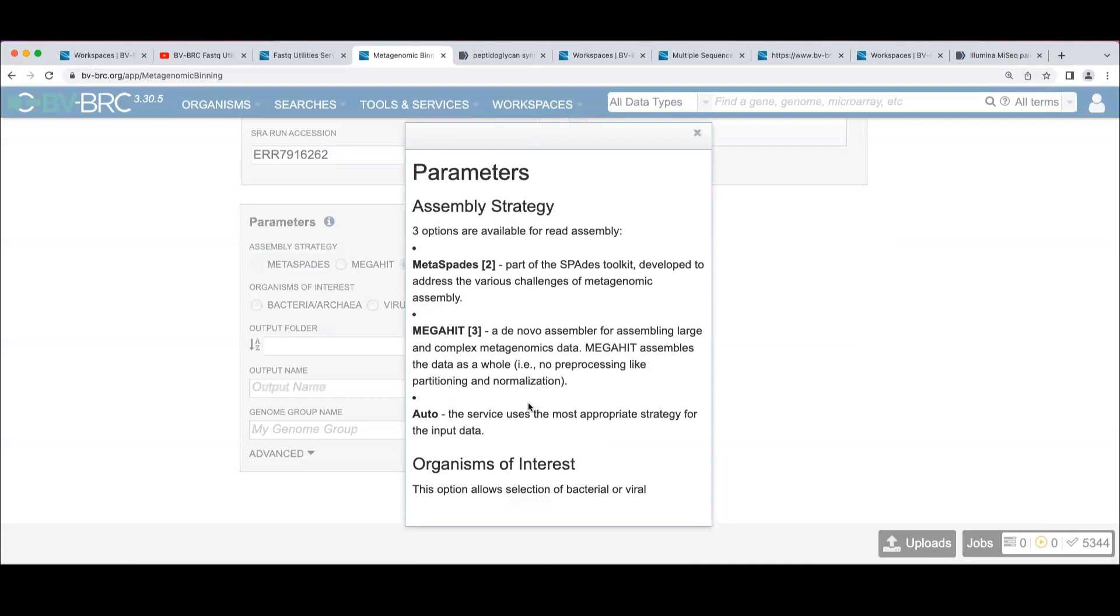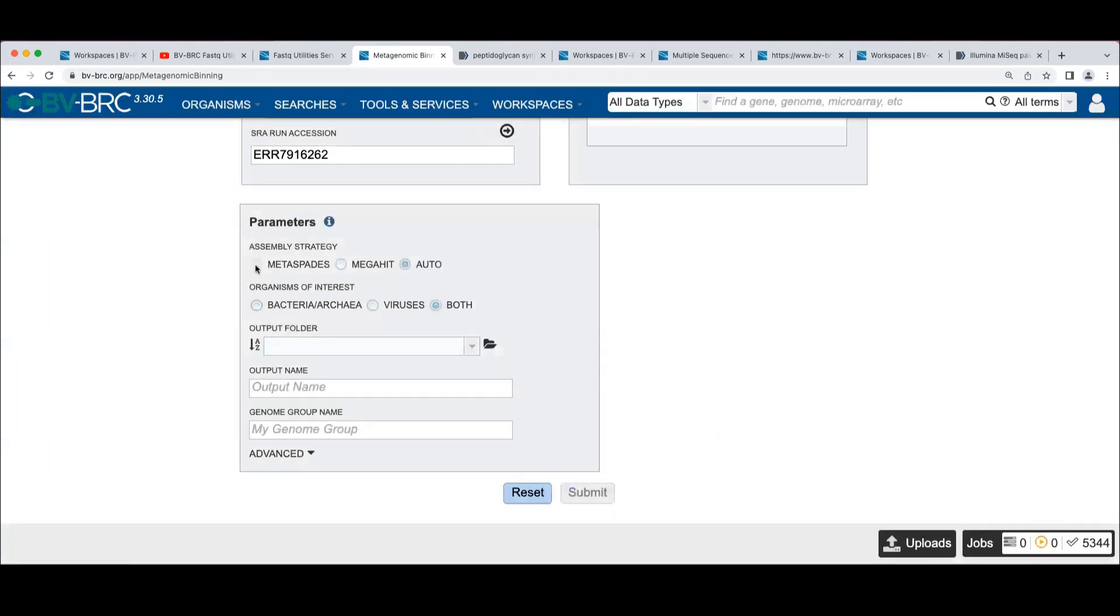Auto will pick the most appropriate strategy. Where here appropriate is if you can use Metaspades, it will. In the case where you just have a single paired-end library input, otherwise it'll use MegaHit.